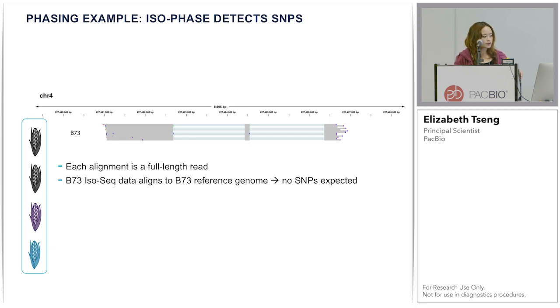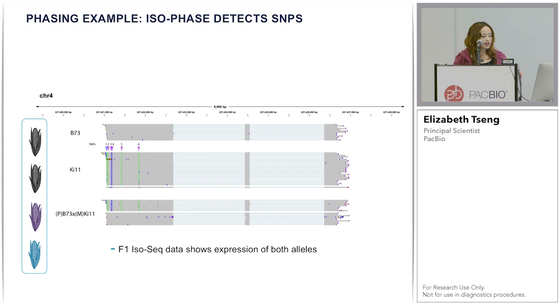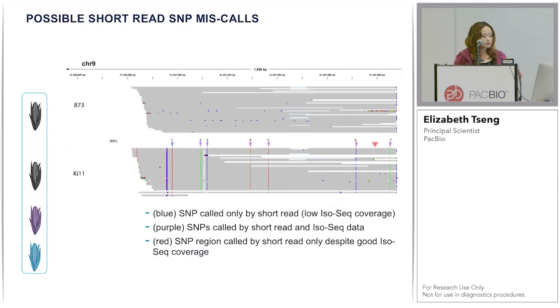In the first example, showing just the B73 reads mapping to its own reference genome, you should not see any SNPs. Looking at KI11, there are six SNPs marked by purple and blue arrows. The blue arrow indicates a SNP found with short reads only due to lower IsoSeq coverage at the 5-prime end; SNPs two through six were confirmed in both short and long reads. Looking at the two F1 hybrids, we can see that both parents are expressed. I'm also showing a possible example of short read SNP miscalls — on KI11 you can see seven SNPs, but between SNPs six and seven there is a region with SNPs called by short read only despite good IsoSeq coverage and no indication of SNPs there.